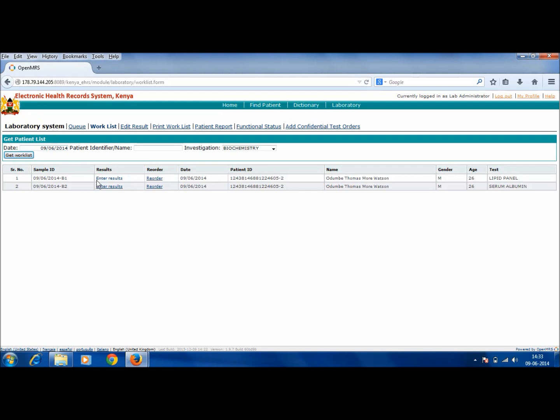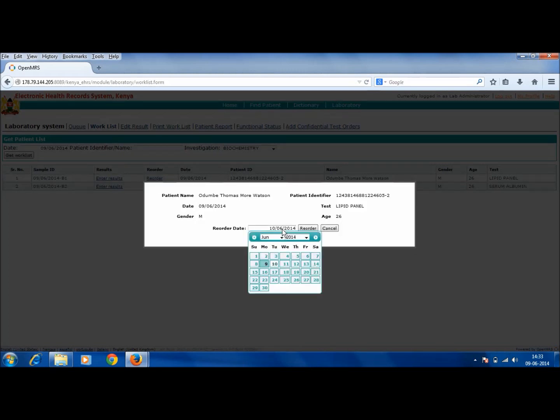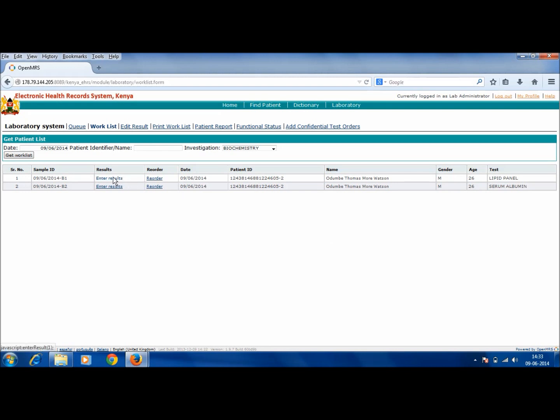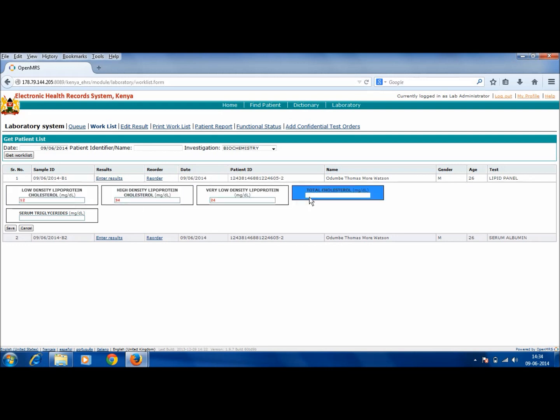Now there appear two options: Enter Results and Reorder. In case a test has to be reordered, it can be done by clicking on Reorder and by putting in a reorder date. So the test is then reordered for that day to which it has been scheduled to. Or else we can enter results by clicking on Enter Results and by putting in the values in the fields that appear. After the fields have been filled in, click on Save.